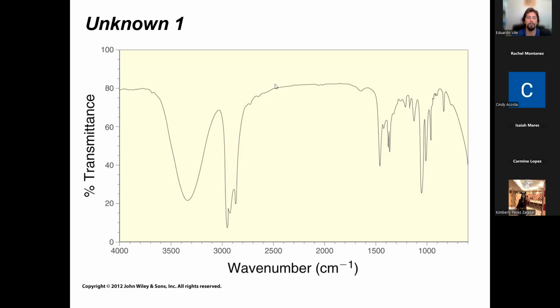No, you would only get marked wrong on stuff like, for example, if you call an OH a CH, then yeah, that's wrong, right? Or if you point to something that's not a carbonyl at like 1000 when carbonyls are at 1700, then yeah, that's wrong. But if you point to a peak and say, oh, this could be a carbon oxygen peak and it's at 700, it's like, well, good guess, but no. Try to stick to the ones that we can tell for sure. That's really what we go for when we're doing IR spectra, right? We only start guessing at the very end if we got nothing else.